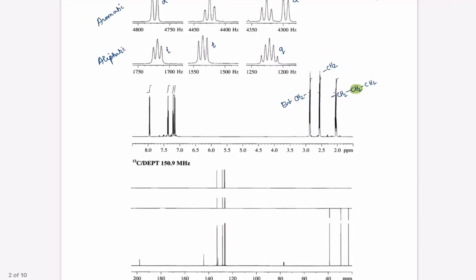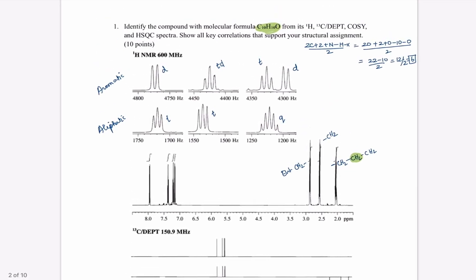And then what we are going to do here is subtract these many carbons and hydrogens from our original molecular formula to find out what other groups are present. So let's do that now. So C10H10O minus, we have 3 carbons and then 6 hydrogens. So when we do the subtraction, we are getting C7H4O.